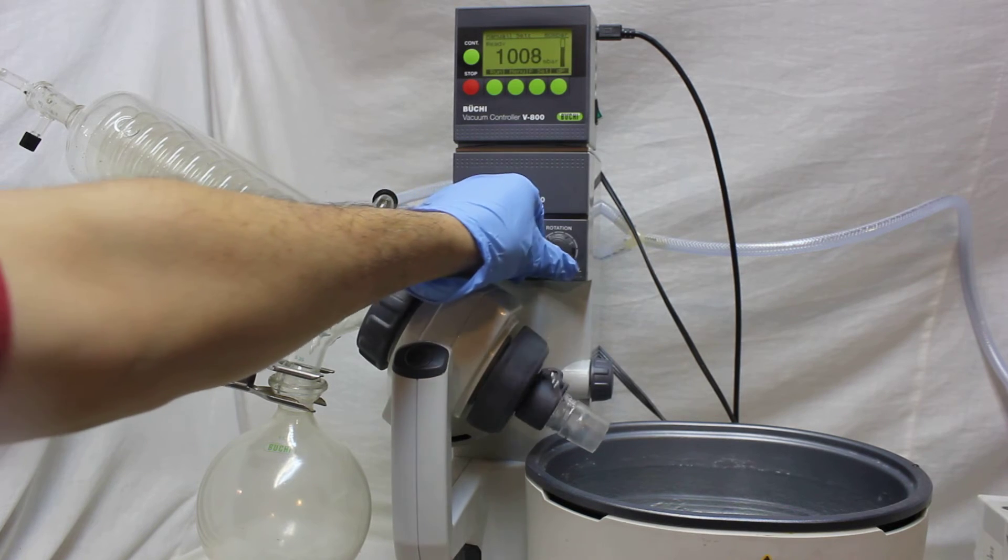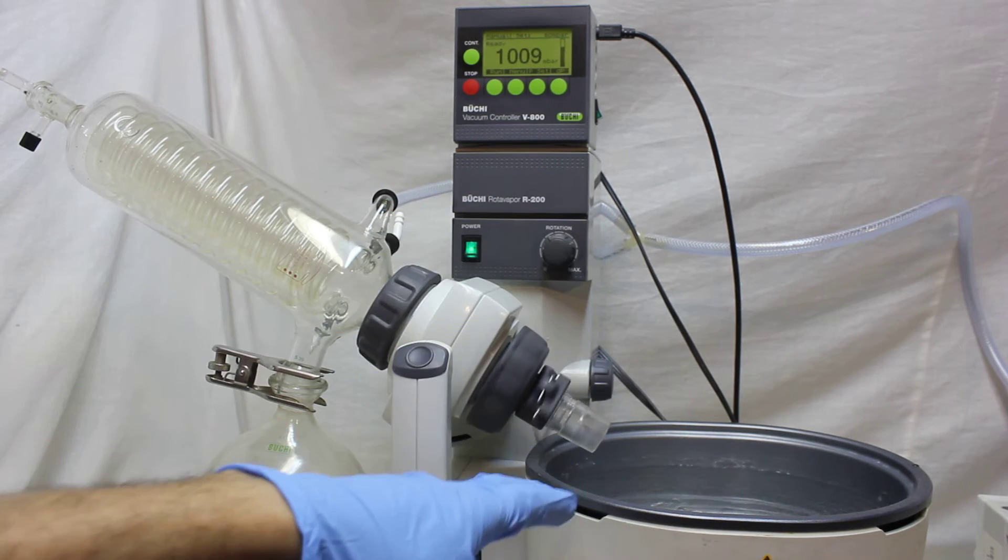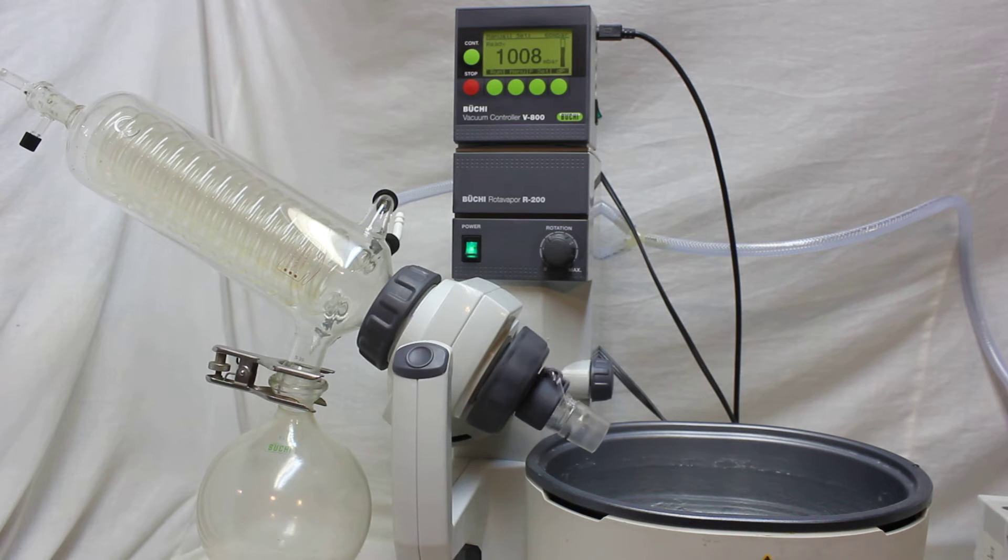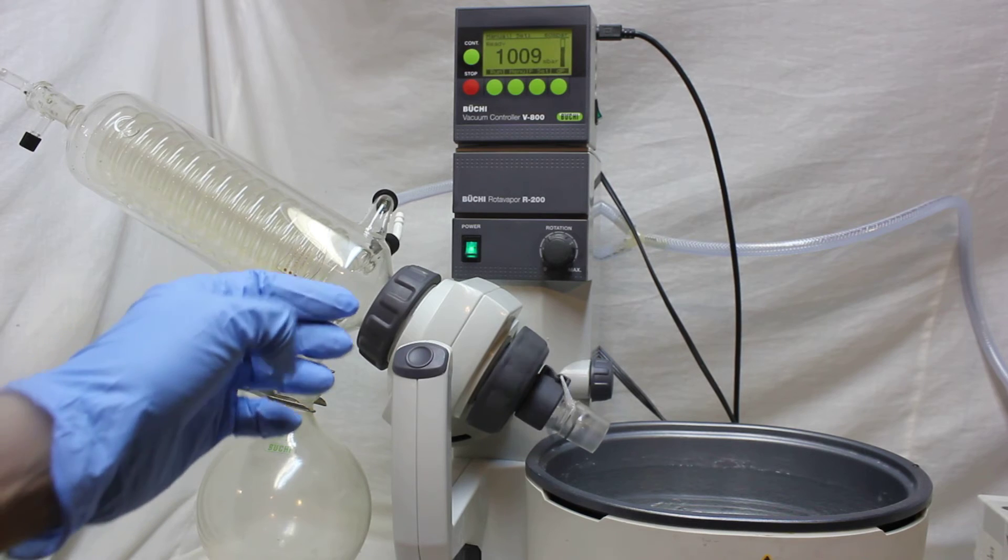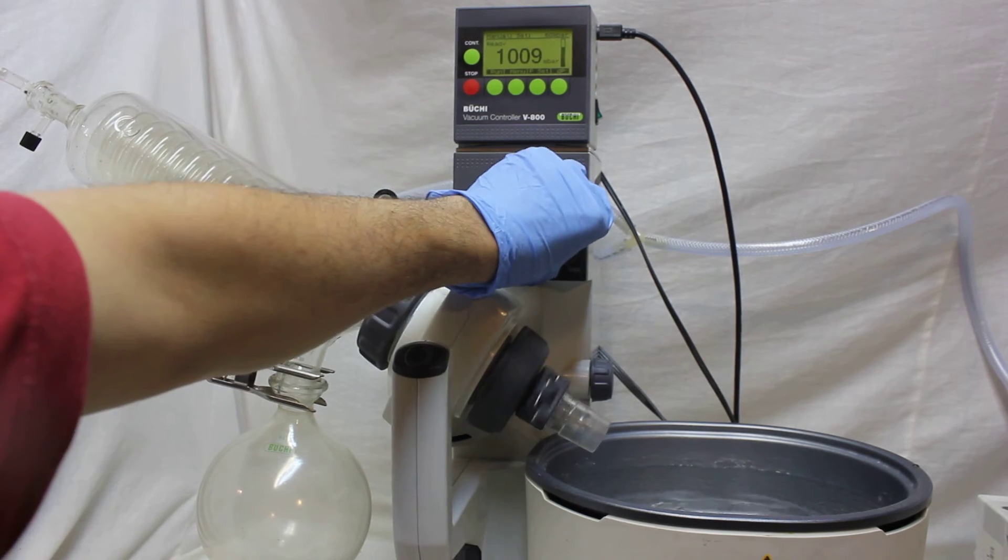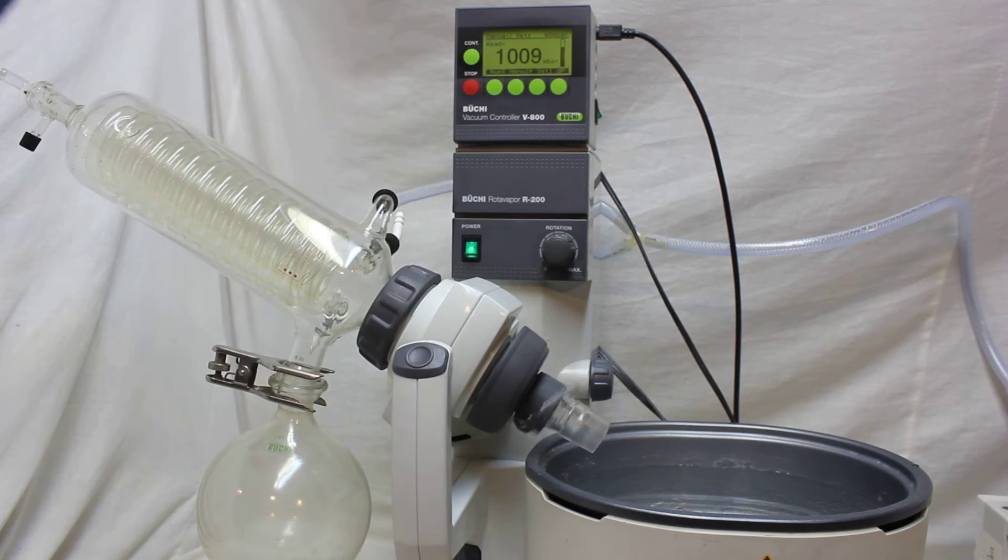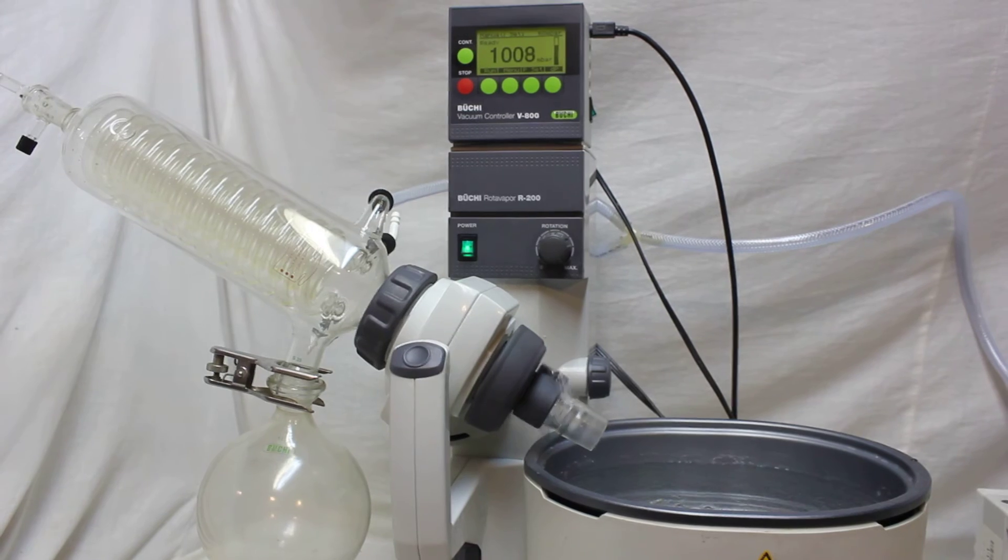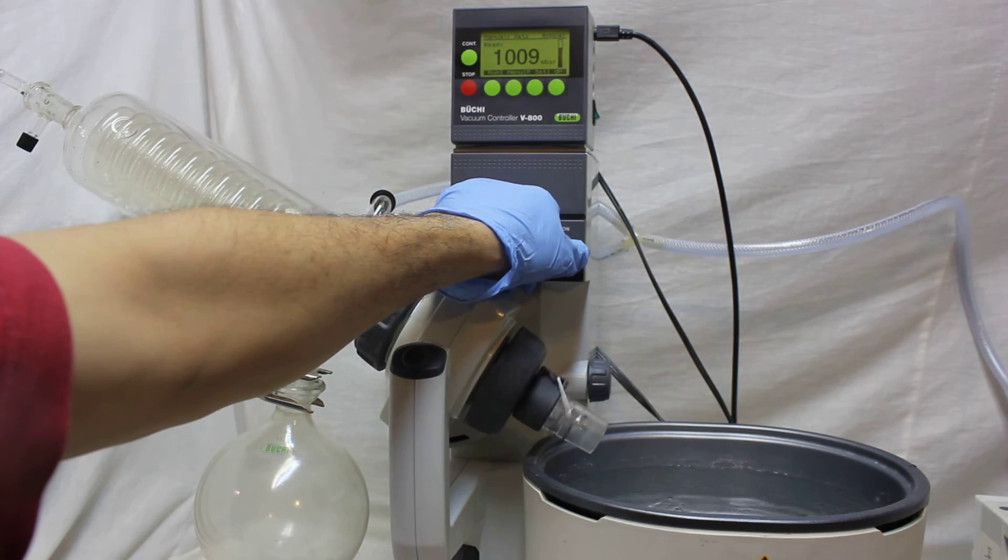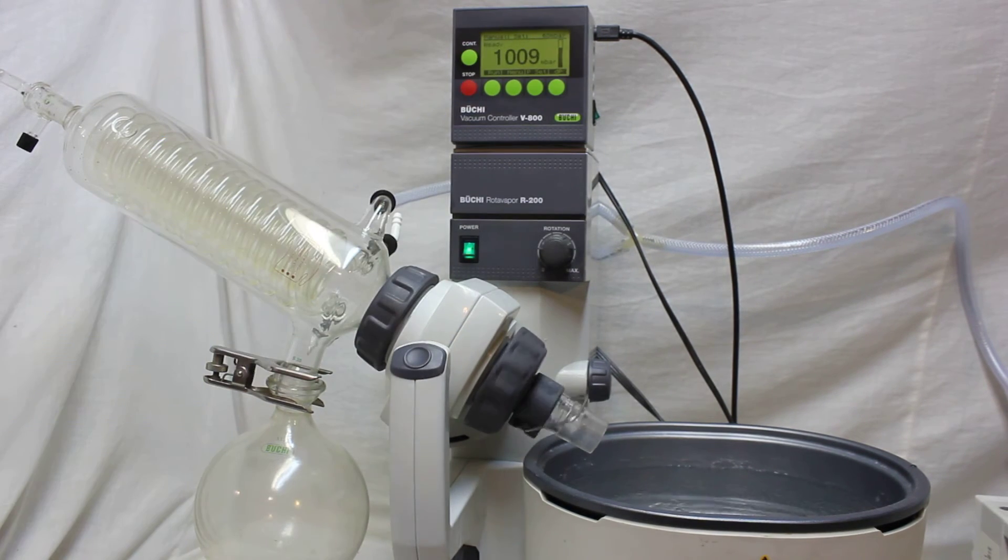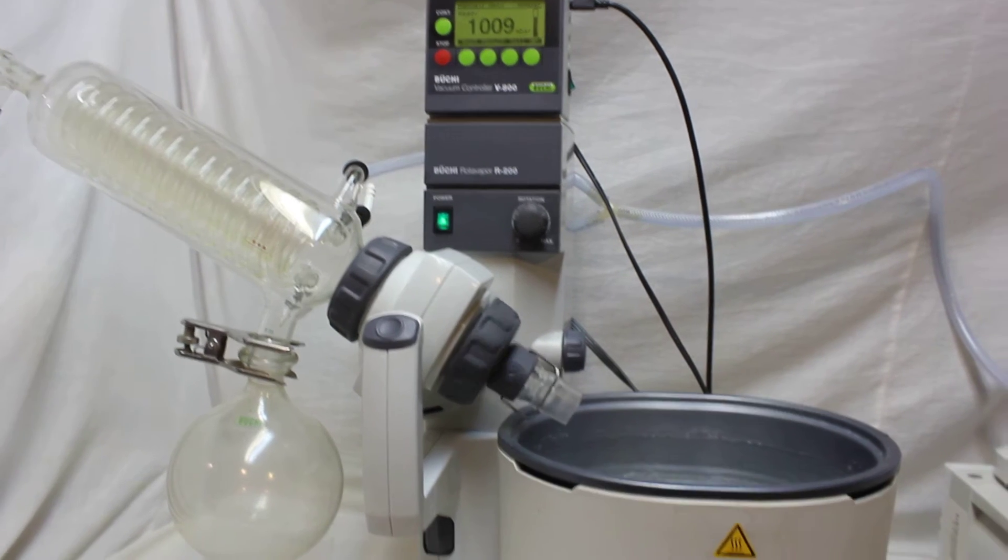If you want to use it for North America, you need to use a converter, 29 to 24, which is very cheap and easy—nine or ten dollars. You can purchase it easily. The rotation is very smooth, gentle, and slow.